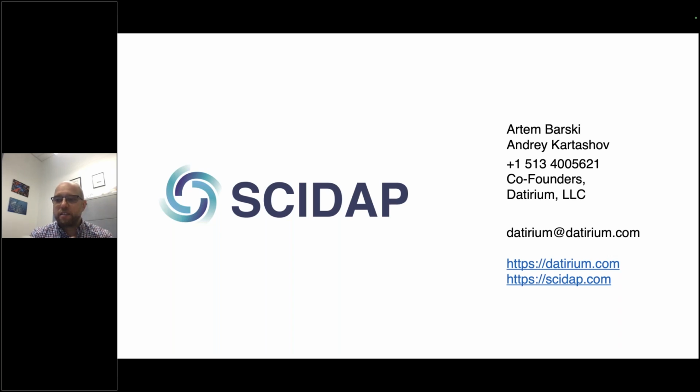I guess the rule of thumb is that if your samples are kind of similar, for example, you have PBMC samples from different donors, then you want to use Seurat SCTransform. This is because SCTransform tries to find the cells that are the same in all samples. They call them, I think, anchor cells. And they make sure that the cells are falling in the same UMAP coordinates in the same cluster.